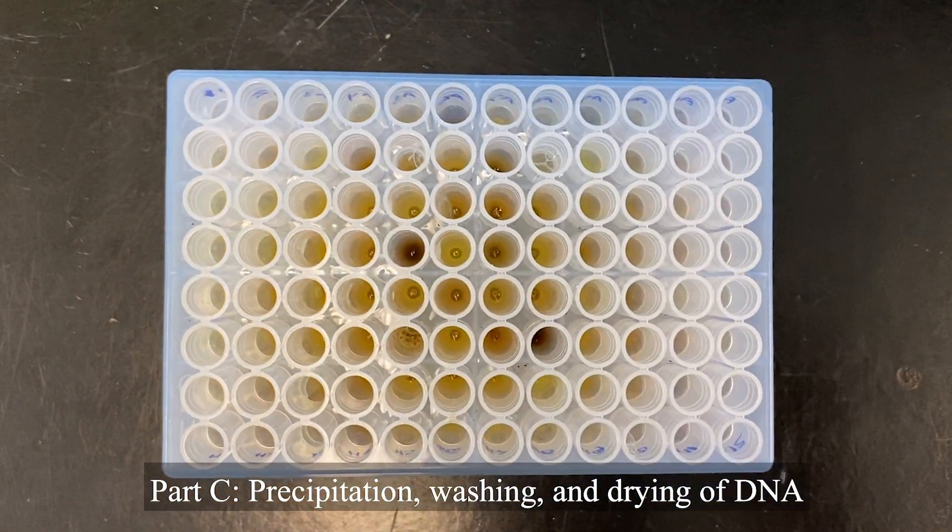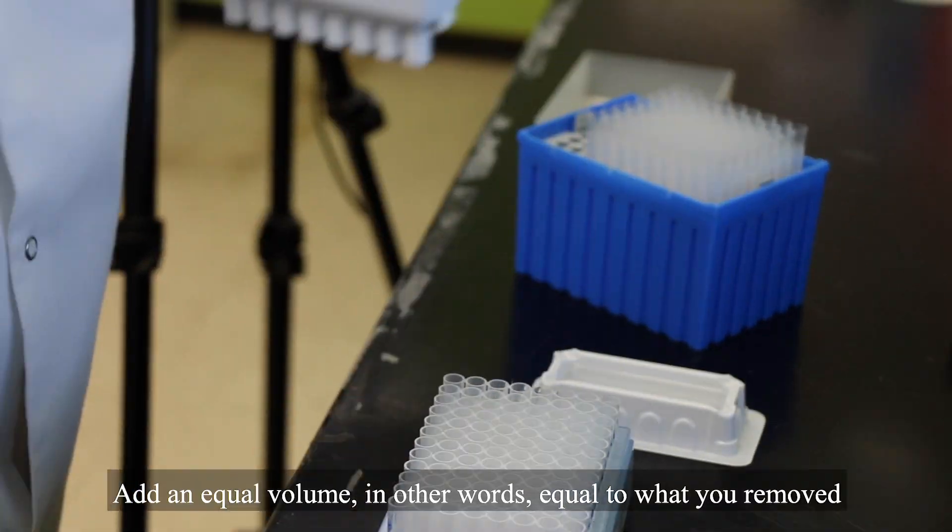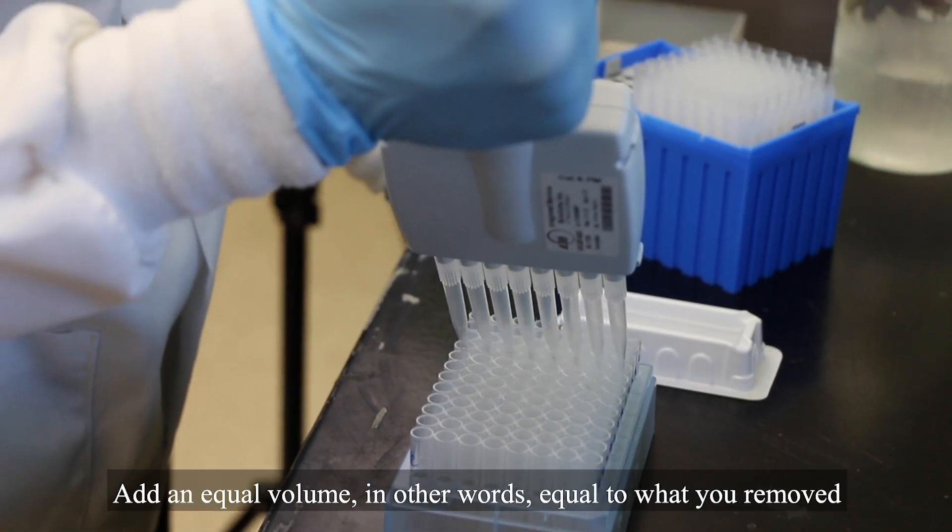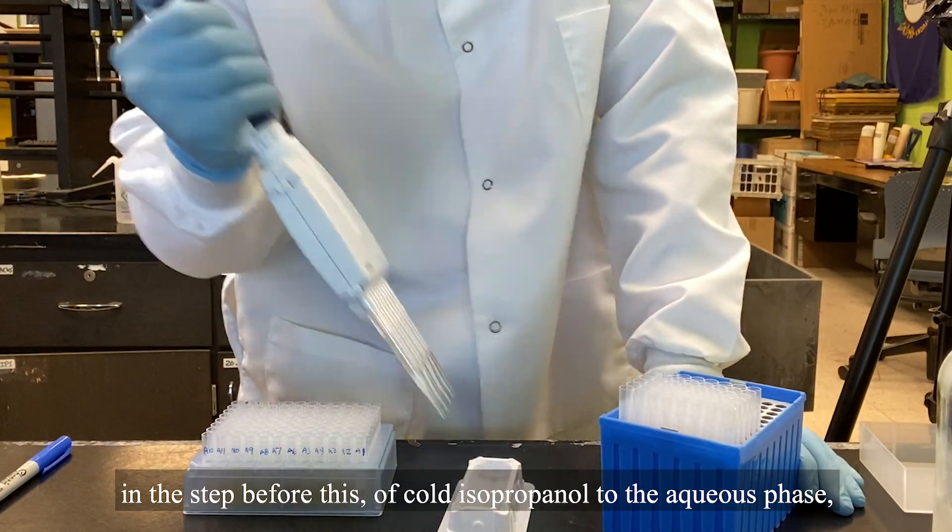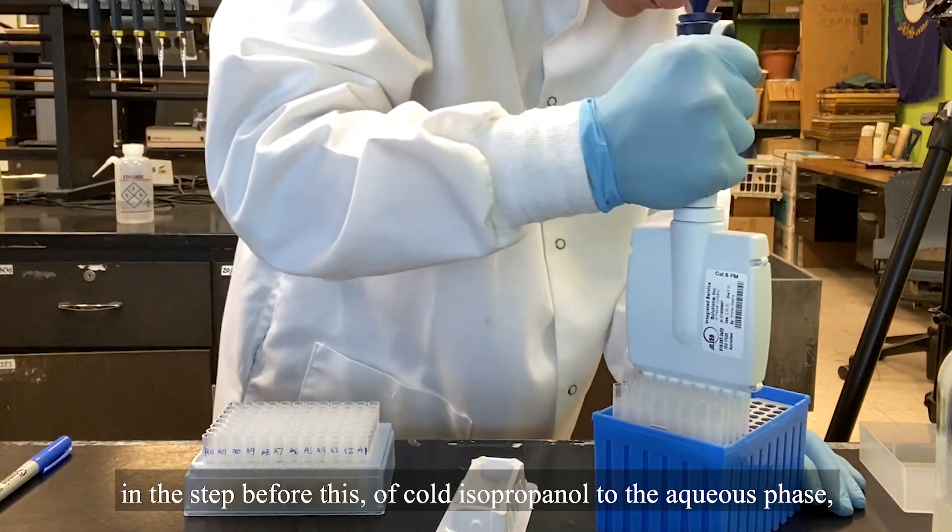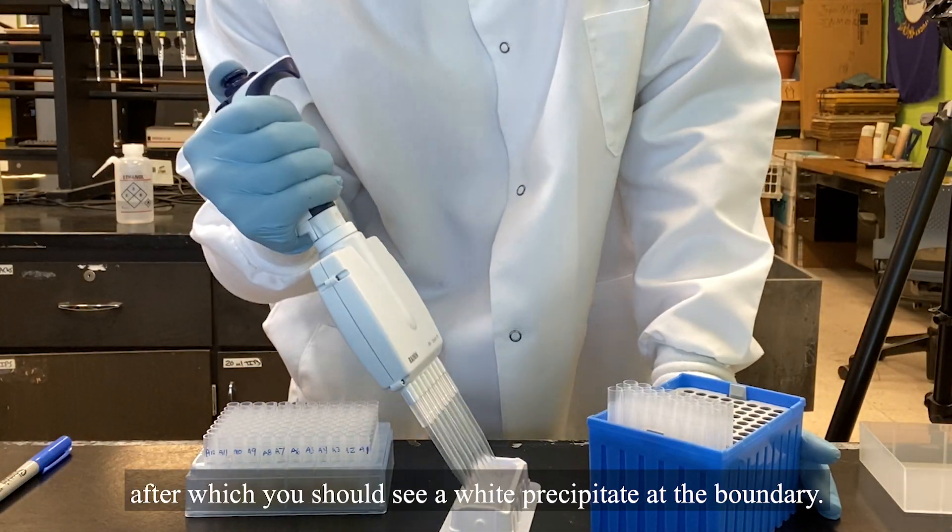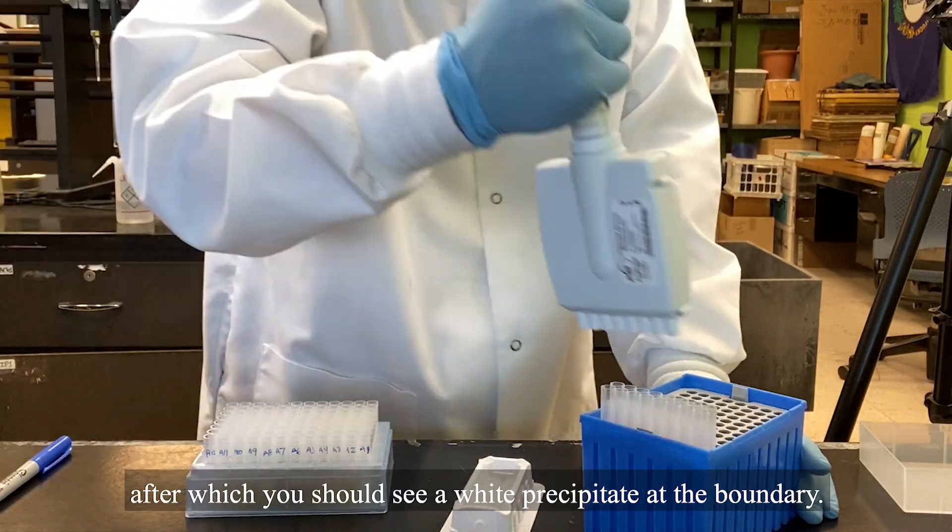Part C. Precipitation, washing, and drying of DNA. Add an equal volume, in other words, equal to what you removed in the step before this, of cold isopropanol to the aqueous phase, after which you should see a white precipitate at the boundary.